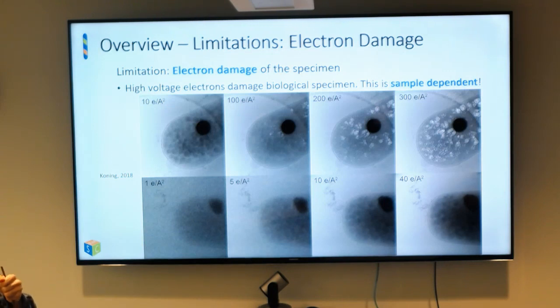Do you have something that you're trying to average, maybe a ribosome in various different orientations? Then who cares, it's fine, we can just collect a few images up to 45 degrees, and we can sit under that 100 electrons, no problem, because we're going to pull it out of many different tomograms and average them together. Is this a unique thing and you just need to know the structure of whatever membrane's in there or something like that, then you're pretty critically limited at this particular sample.